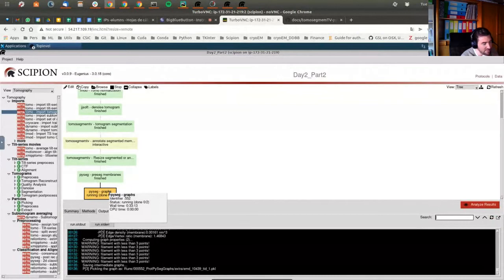We need 2 things, which is high velocity for writing and reading from disk, and a good high memory source, and as many CPUs as possible. And the second and third aspects are fully covered by these machines, but I wasn't expecting the disks to be so slow.